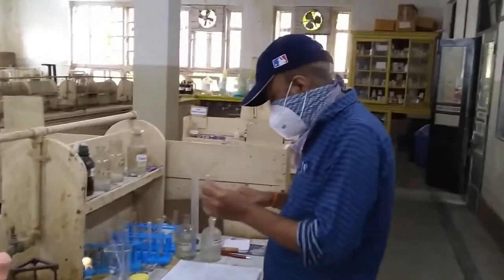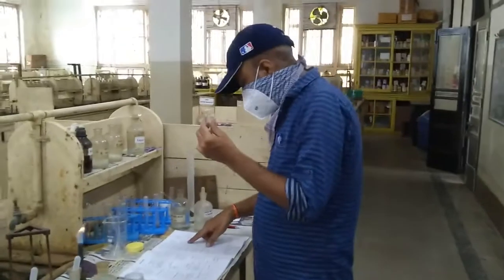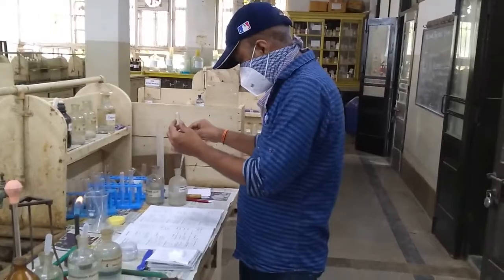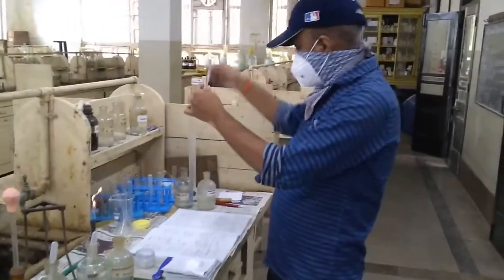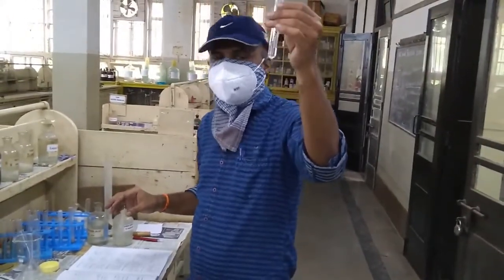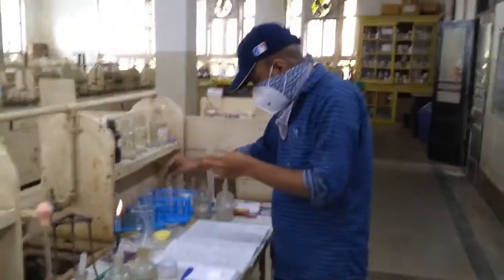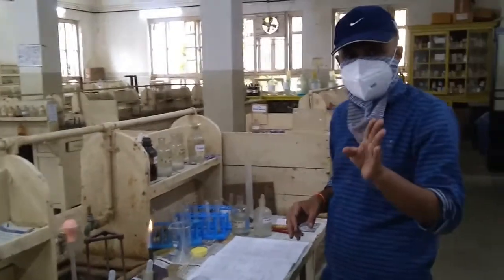Let us add a little amount of NaOH, which gives the white precipitate, and if we add excess NaOH, then it becomes soluble. So a colorless solution forms, the precipitate being soluble in excess of NaOH in this test. Now the second CT; there are only two CTs we are going to take.